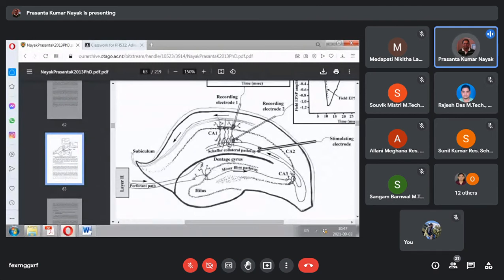I will teach you all this in the next course, probably next year, next semester. I will just conclude here saying that these cells you look at here, you are actually quantifying c-Fos expression in one slice of CA1. These are the cells of CA1. Can you see the dotted line? And these are the triangles. They look like pyramidal cells. They are called pyramidal cells.